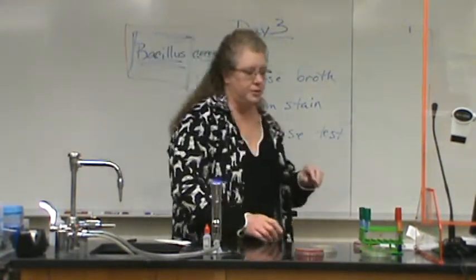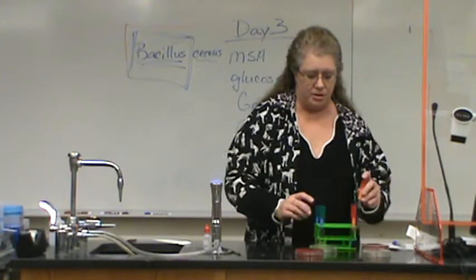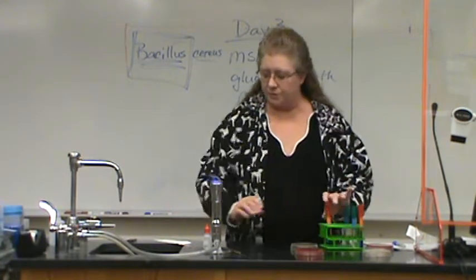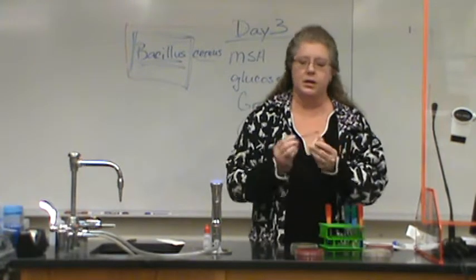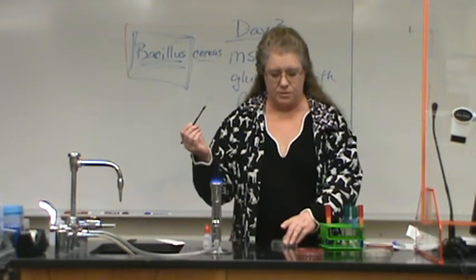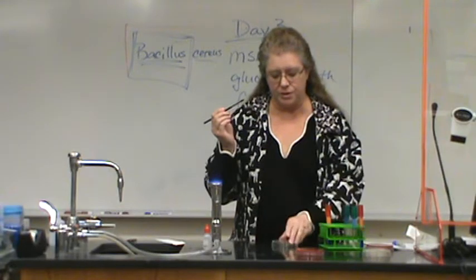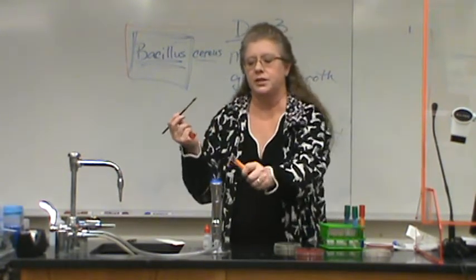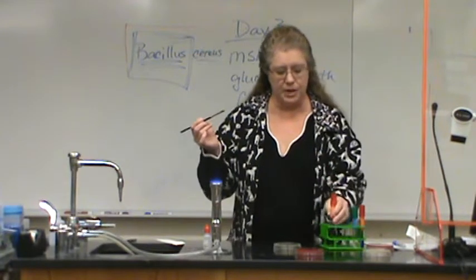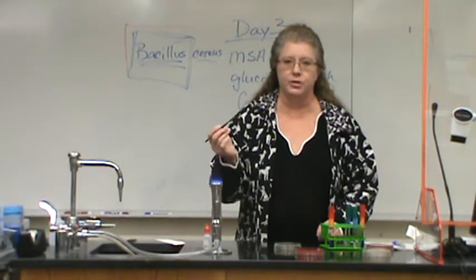For the glucose broth — remember our purple glucose broth — this is to look for glucose fermentation. We have our isolate number one broth and we have the plate, so you can use either one. I'm going to use the plate: take your inoculating loop, sterilize it, pick up your isolate number one plate, cool it, get a little bit of your isolate number one, pick up your glucose broth, remove the lid, flame the top, go in, then flame the lid back on. You have now inoculated your glucose broth with your isolate number one.